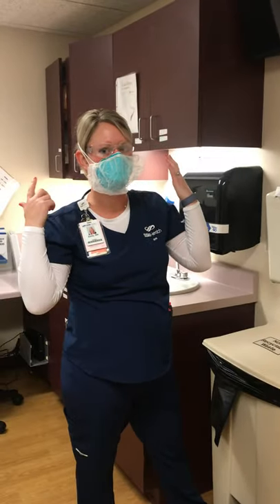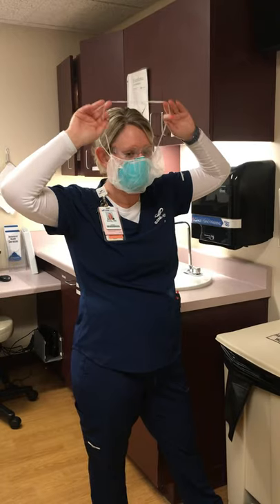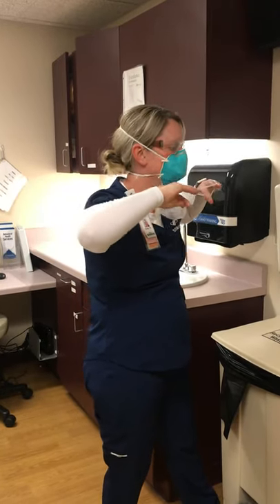Last, I have a beard cover. Be cautious not to touch anything on the outside of the beard cover.